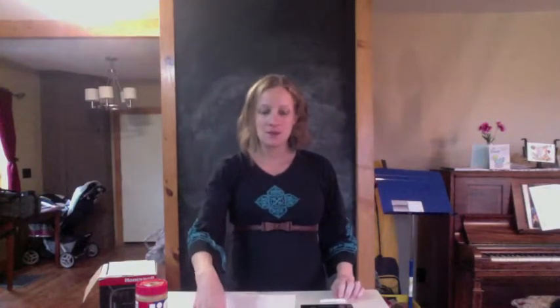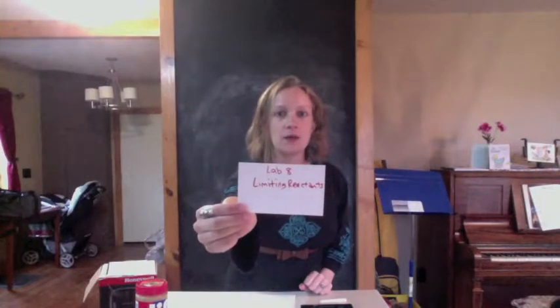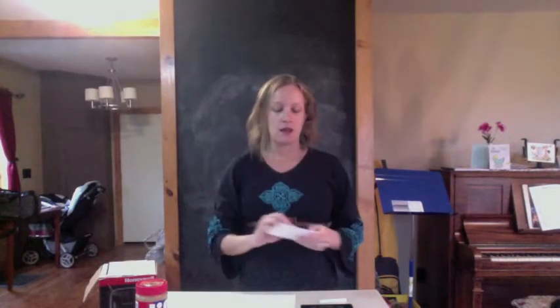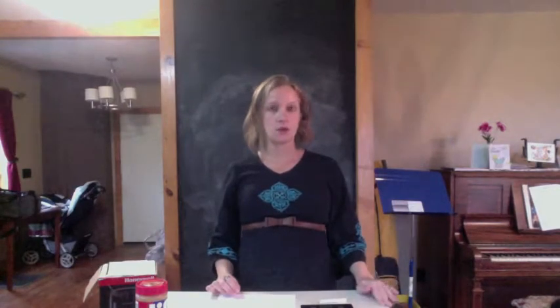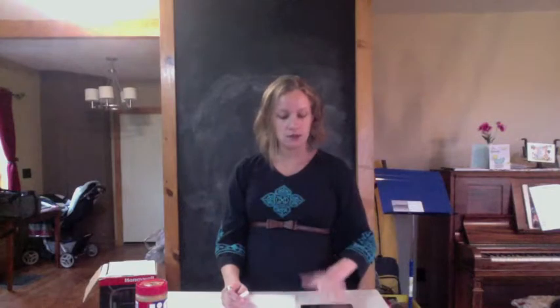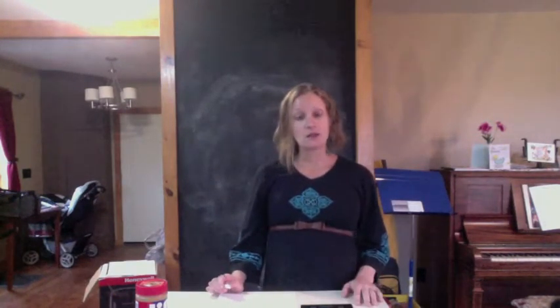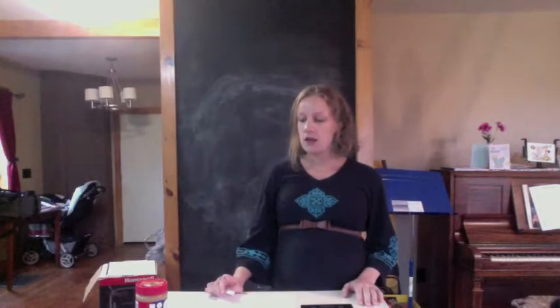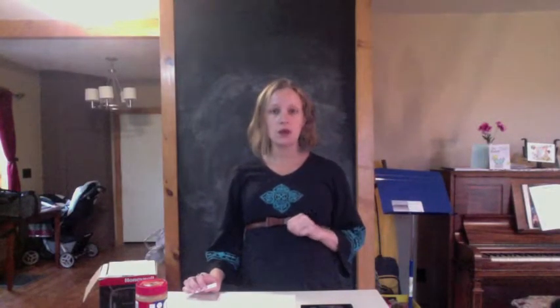So here we are with lab number 8, and this is a really great experiment for you to do. We're talking about limiting reactants, and I think this will really help you study for exam 3, which is coming right up. Make sure that as you do this, you're really clear on your calculations and everything that's involved with limiting reactants. So in your lab manual, you're going to see 3 options for this experiment. You only have to do one.